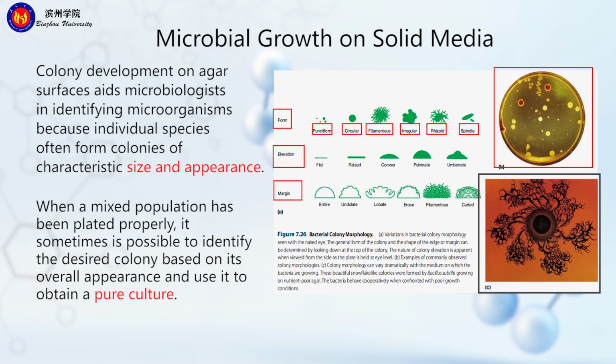When a mixed population has been plated properly, it sometimes is possible to identify the desired colony based on its overall appearance and use it to obtain a pure culture. That's all for this section.